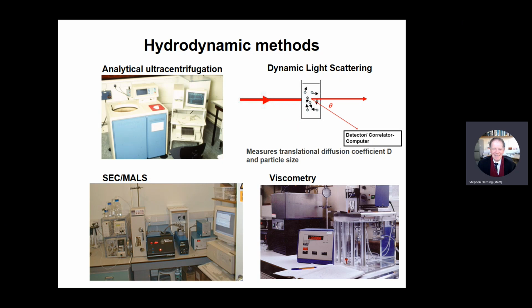Generally, the smaller molecules tend to be more nippy. They move around faster, and also the compact molecules move faster because they experience less frictional resistance as they're moving through the solution. And how fast they move impacts on the fluctuation rates of intensity.